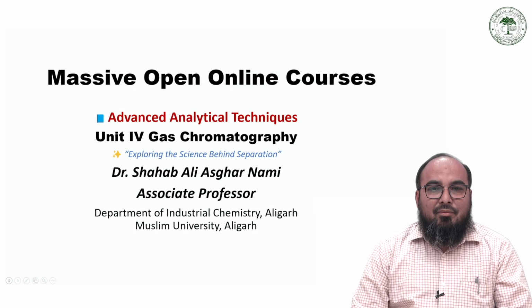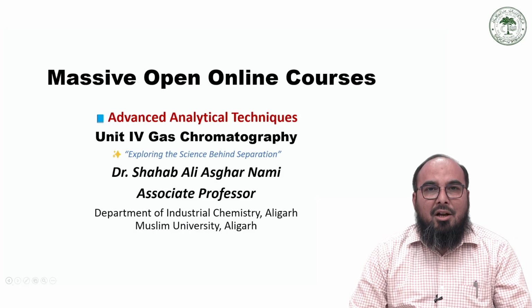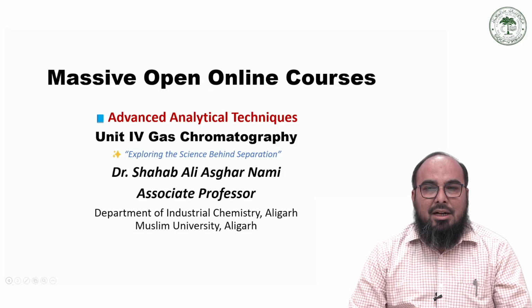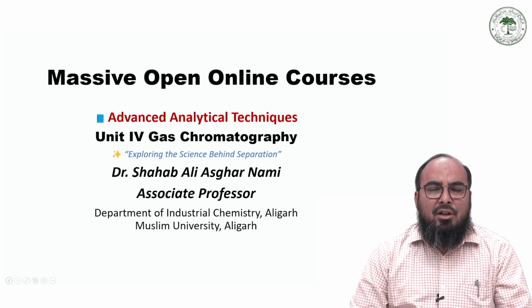Hello students, welcome to this massive open online course on advanced analytical techniques, and today we are going to study the last unit of this course, that is gas chromatography. So gas chromatography is actually an advanced version of the elution chromatography which we have already covered in our previous slides. So let us begin our journey of gas chromatography.